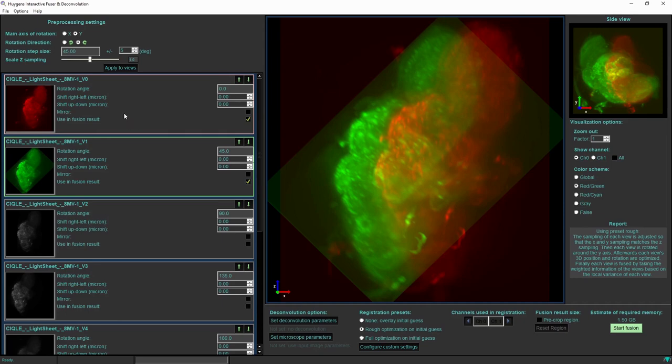Only the first two are selected. The very first view is displayed in red and it is the reference or the stationary view. The second one displayed in green is the moving view.